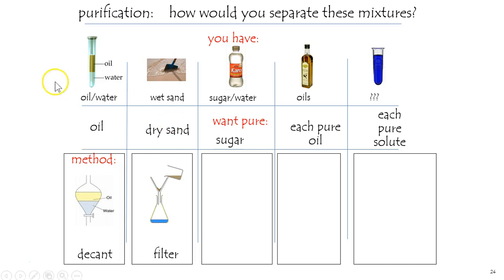for example, if it were ocean water. Better to simply filter it, which means run it through some filter paper by gravity, rinse it a bunch of times with water, and once you've rinsed it a few times, there should be some nice pure sand. Let that evaporate, the water goes off, and you've got the dry sand.